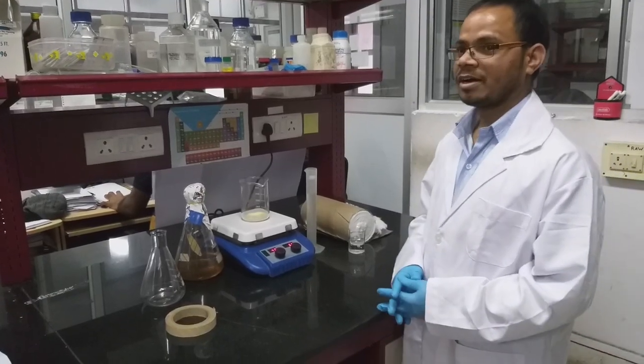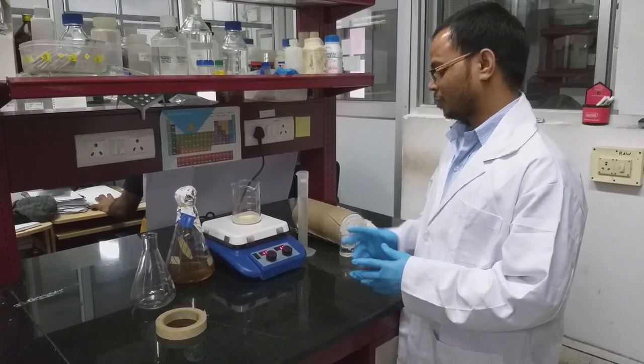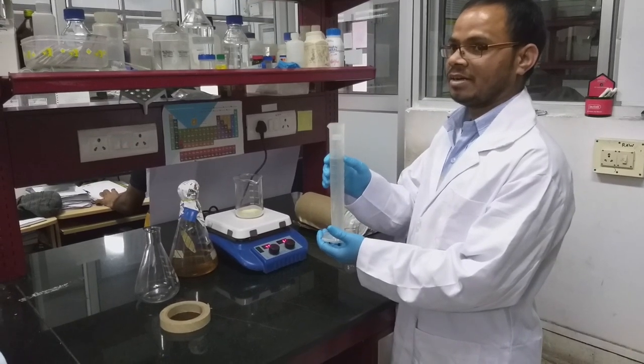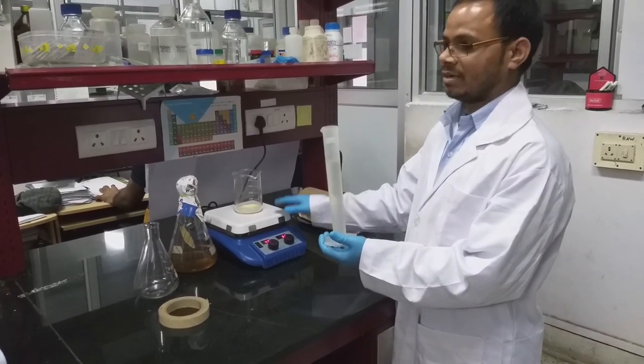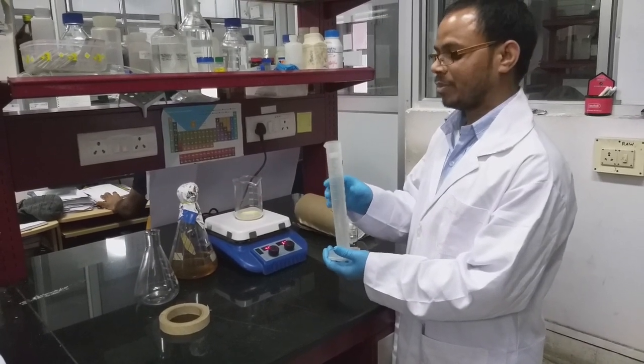After weighing the media components, we have to dissolve them in double distilled water. So initially, we are dissolving in 80 ml of distilled water. Once the components are completely dissolved, we have to make up the volume up to 100 ml.